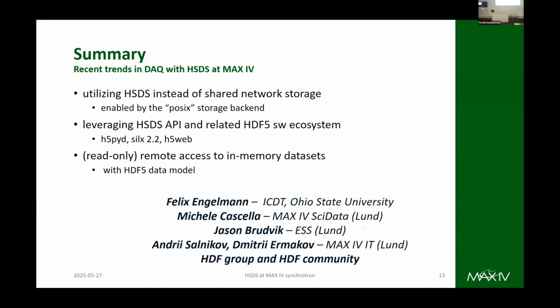Okay, thanks. Very nice talk. What kind of frame rate can you get when you do, for example, the tomography example? So the streaming tomography can run at the speed of the camera. These three orthogonal images can be updated with minimum latency, with every frame that comes. And the cameras that we are using are industrial, good high-speed cameras, but only around 120 hertz.